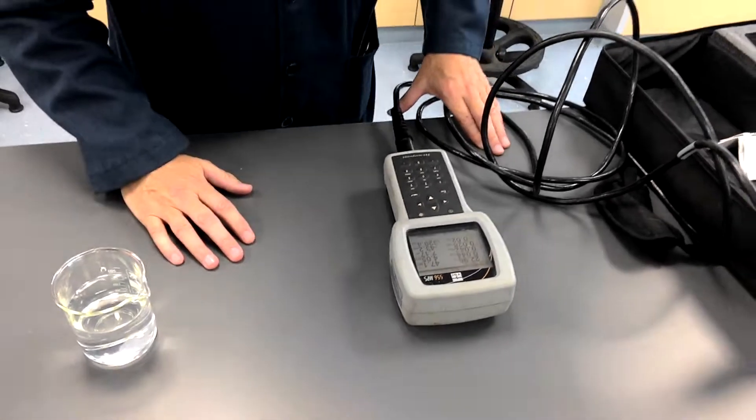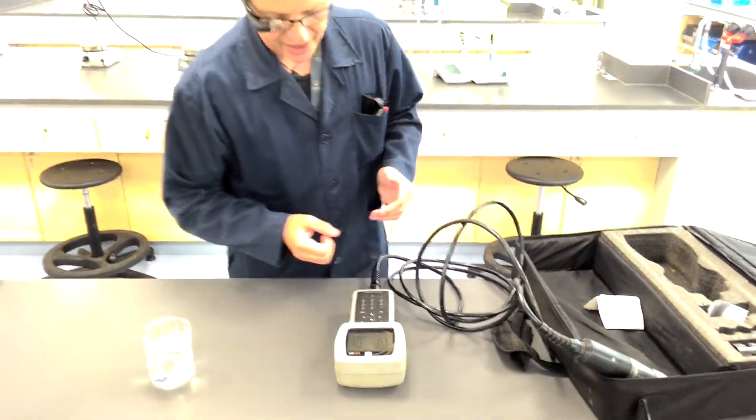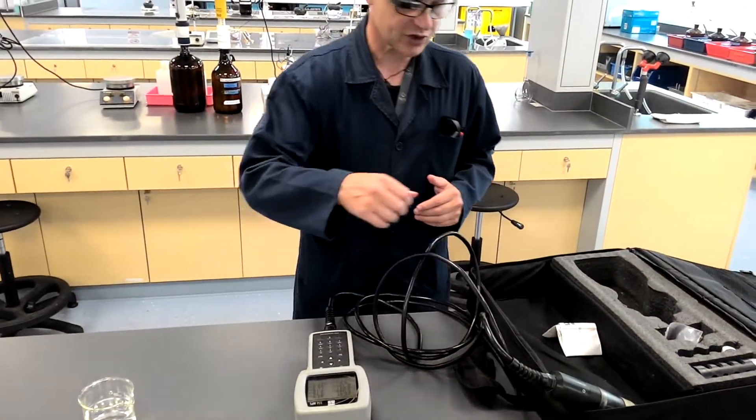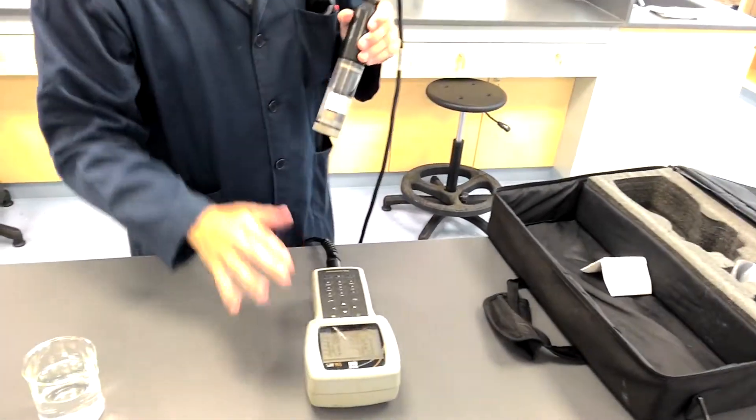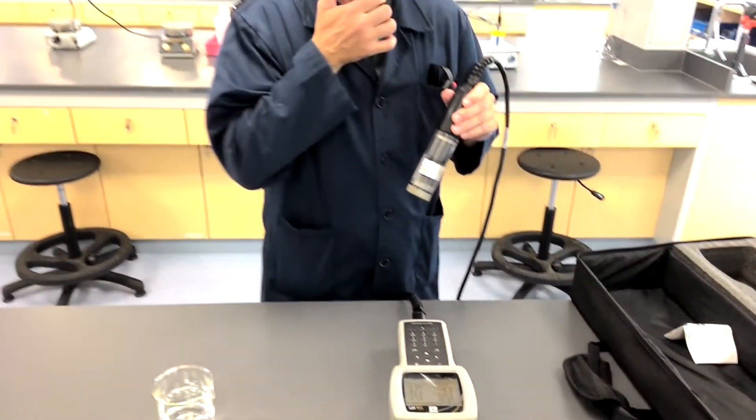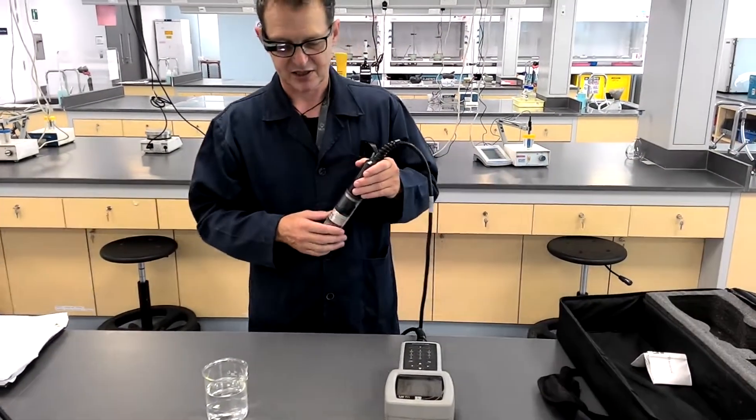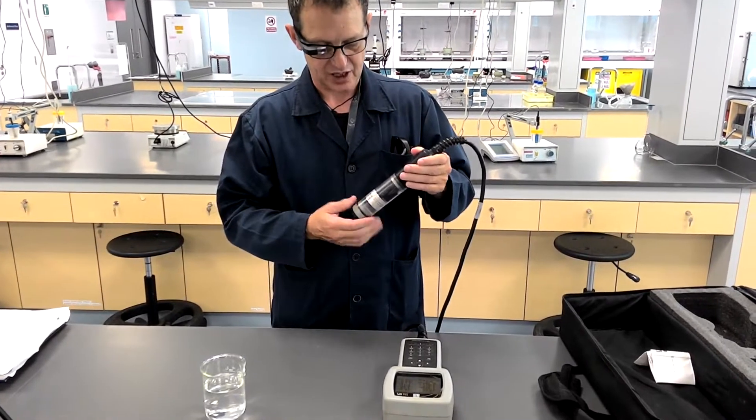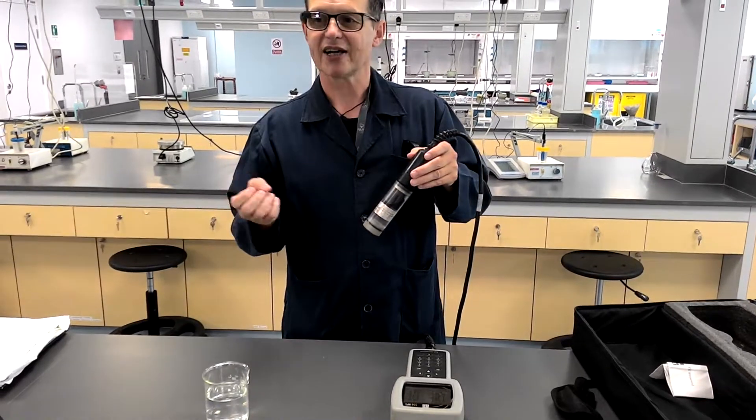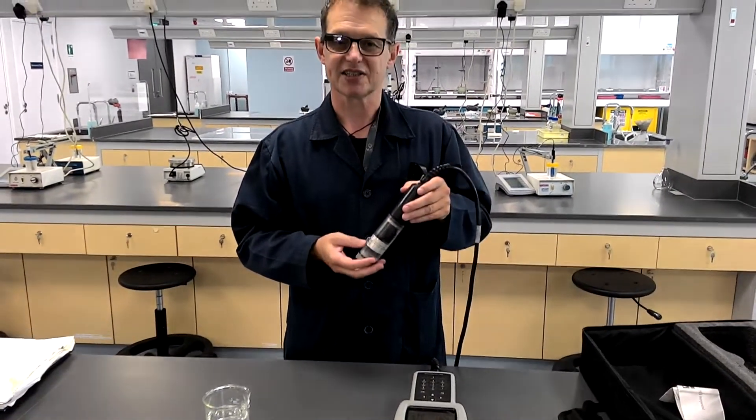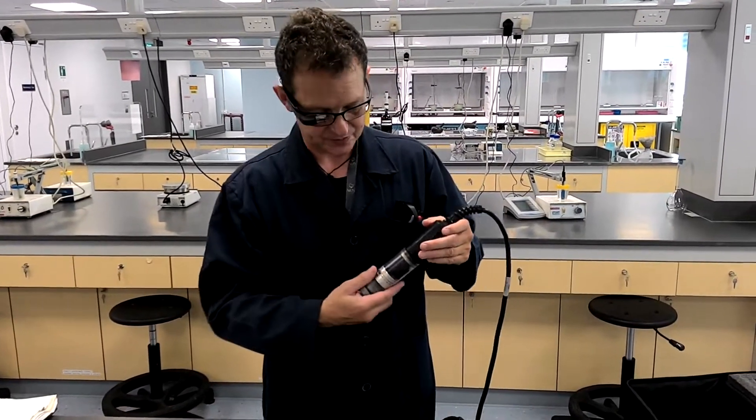It usually takes a few moments and then it will display the temperature and the dissolved oxygen concentration. Now, the calibrations are already in this meter and what's usually done is they are calibrated beforehand. And then the calibration, unlike something like pH maybe, will tend to stay. If we were measuring pH, you would calibrate before every measurement.